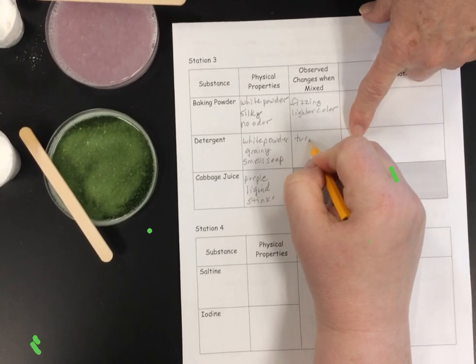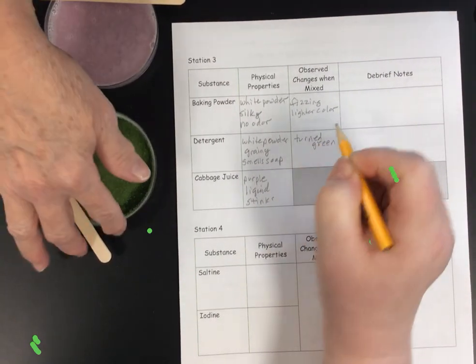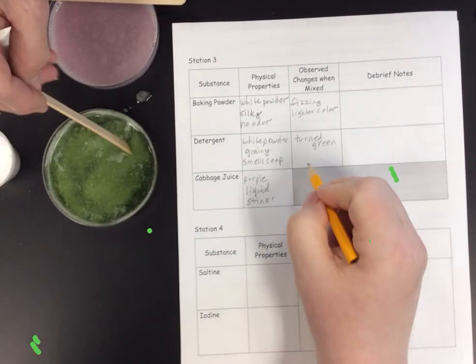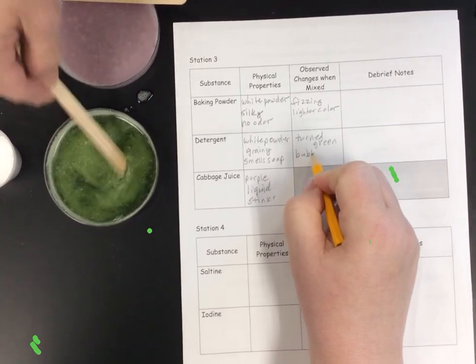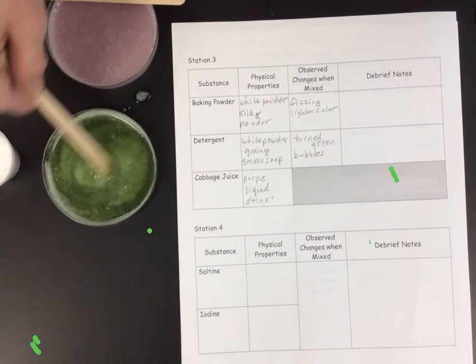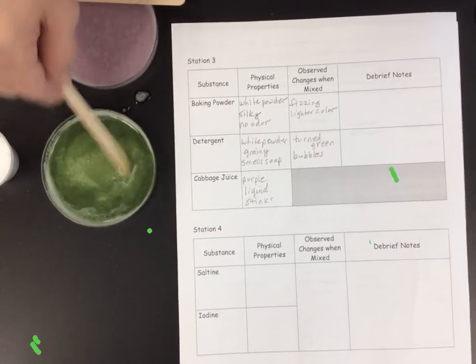Here are our observations. When they're mixed, it turned green. I thought I saw some bubbles here on the edges. There are some bubbles, not as many. If you were doing this, you could keep stirring until it was all dissolved.